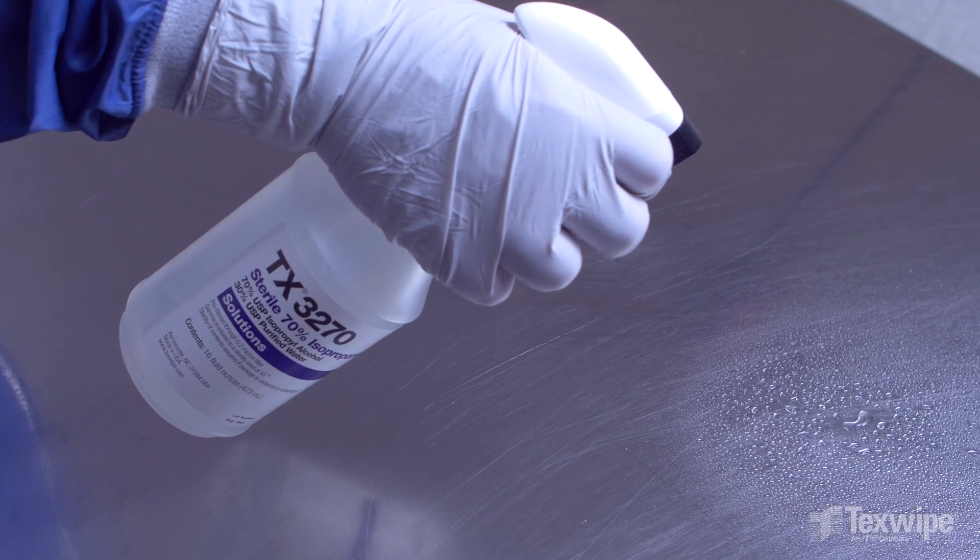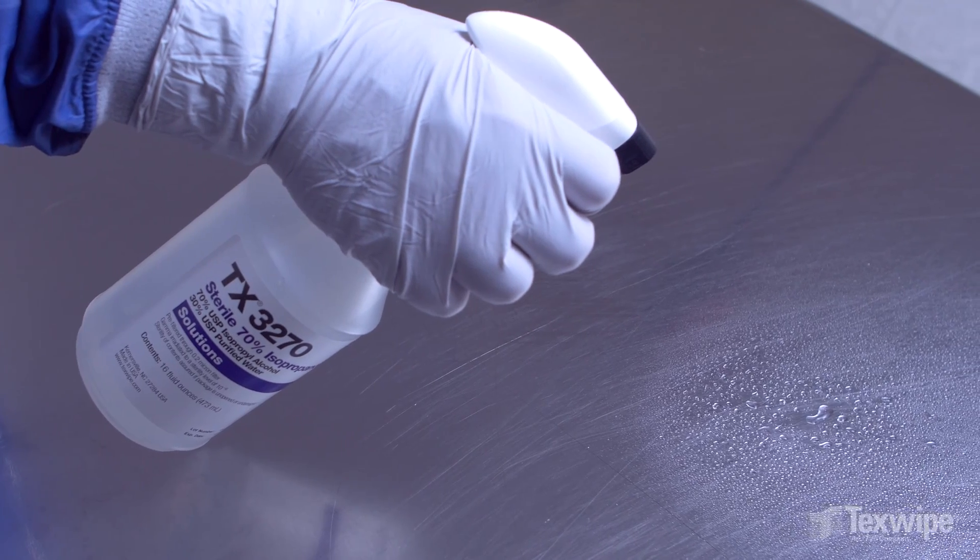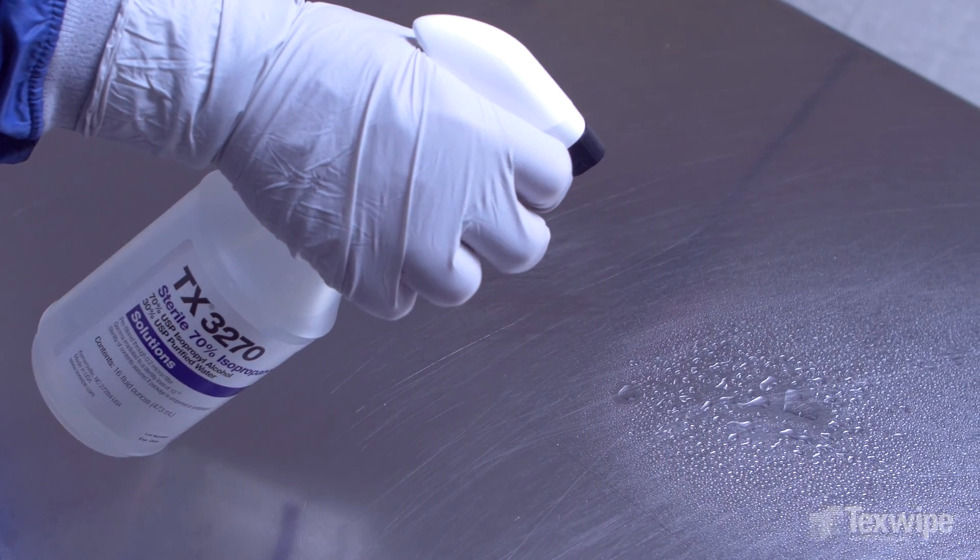Or spray the surface directly. Turn the nozzle to the spray position for wider coverage.